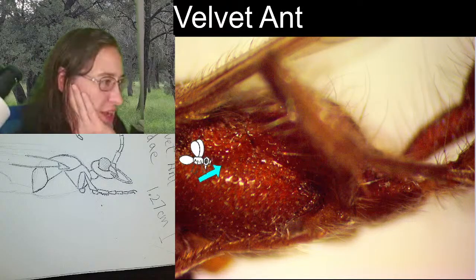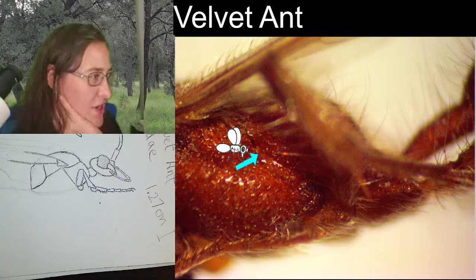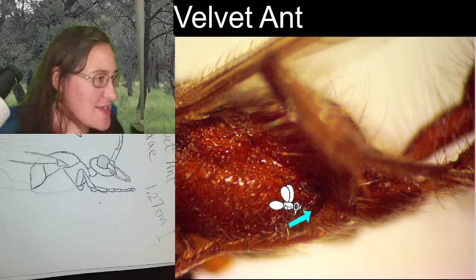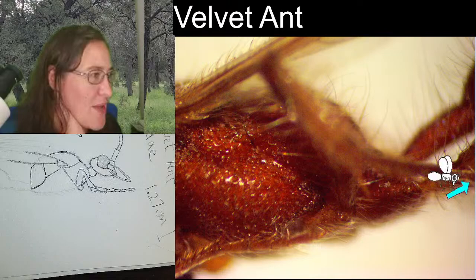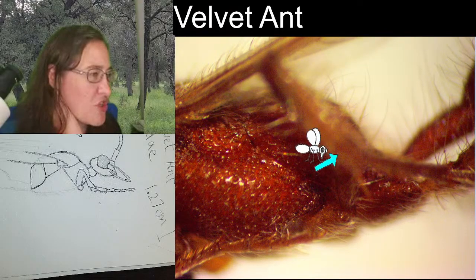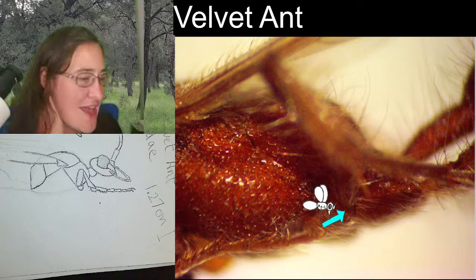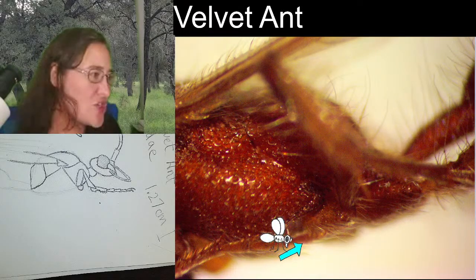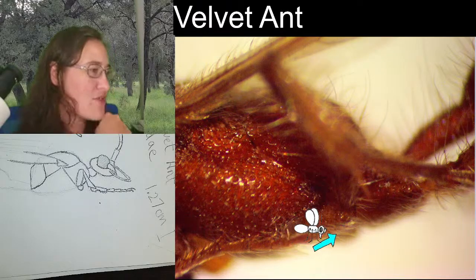The coxa, so this is this whole big segment in here. But then the coxa is right here, and it's this last little triangular piece. And then the femur comes up, the tibia comes down, and this is the start of the tarsal segments. You can see those are a little bit blurrier, and we'll be fixing that shortly as we change focus. But I wanted to show you right here at the bottom that this coxal segment is less roundy and more triangular.